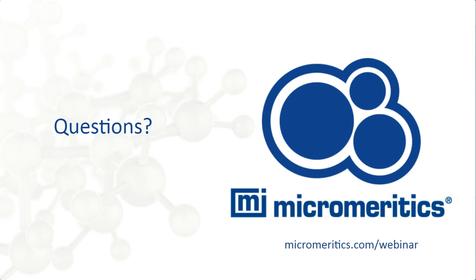Okay, thanks. Yeah. So I guess one of the challenges in any kind of formulation or powder handling process is that things like binders or moisture, which could be added for good reason, for example, forming compacts or granulation, are potentially going to give you problems in other parts of your process. That's right. It might not be expected. It's more likely to be undesirable. But it's important to know that if you add a certain binder, or add moisture, say, at the wrong point, that could have a knock-on effect, and where you don't expect any caking to occur, you may well start to get cakes and crust forming, and the powder might start to solidify.